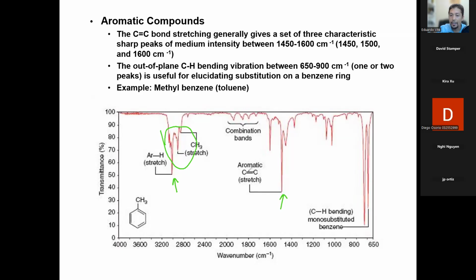Here's another one. This is a carbon-carbon aromatic double bond stretch. Very sharp, always found around 1500. This one right here. This is 1500. Not exactly at 1500. Maybe it's 1450. Maybe it's 1550. Maybe if your instrument is not very well calibrated, it might show up at 1600. These are not absolute values, but the regions are general.